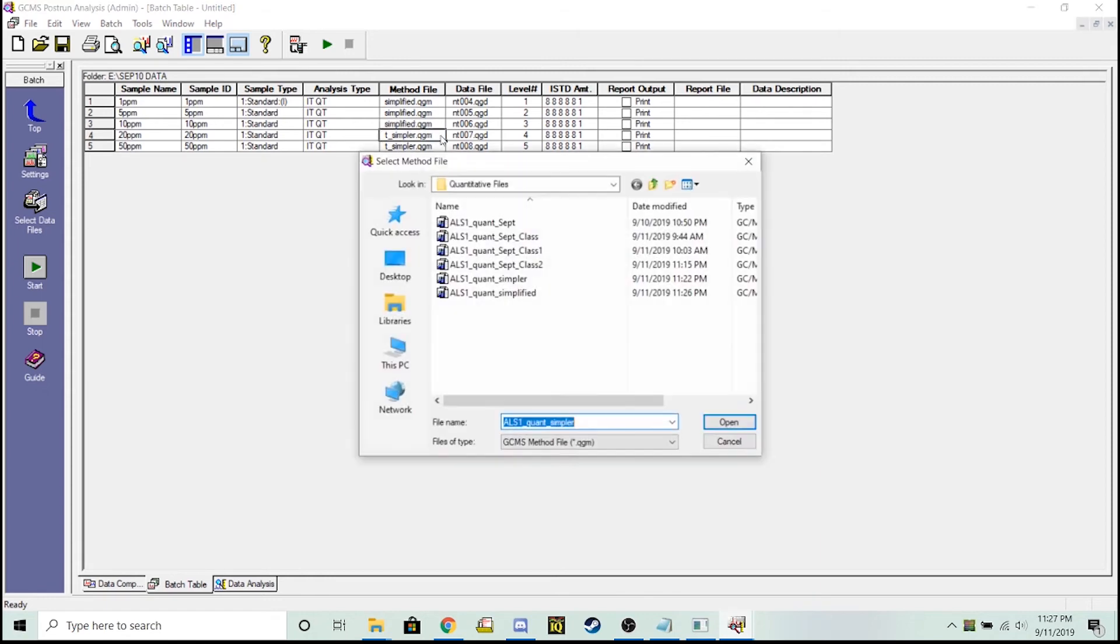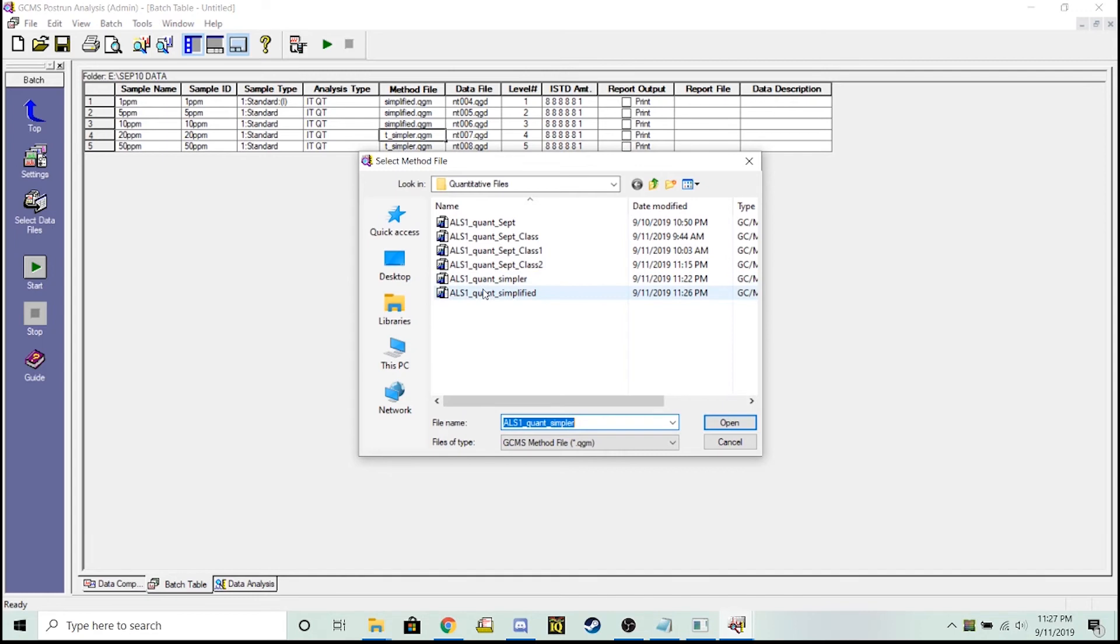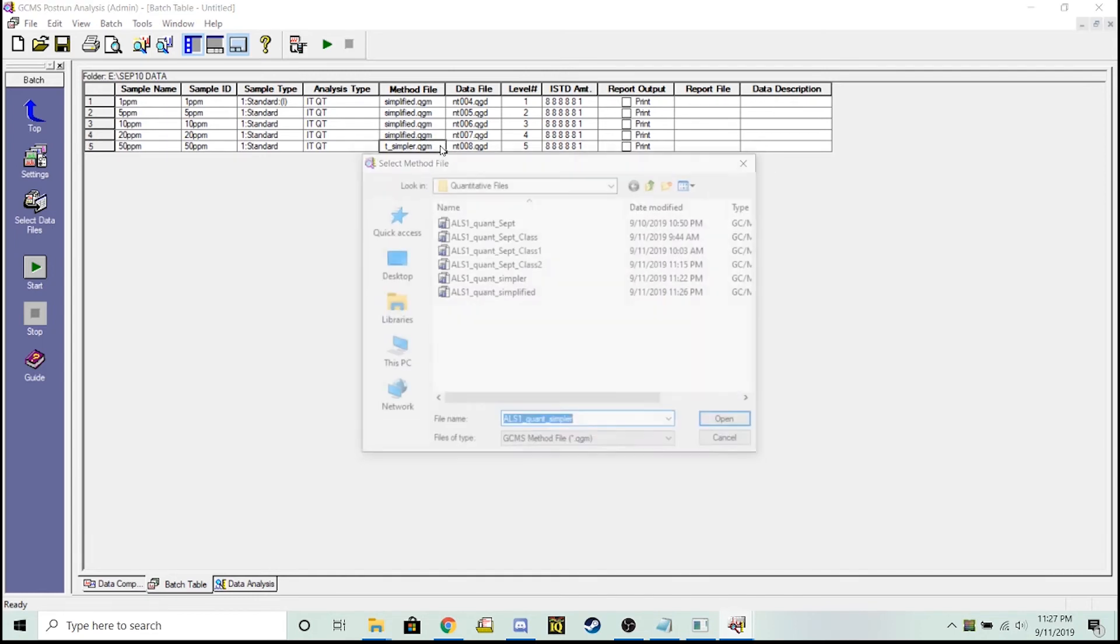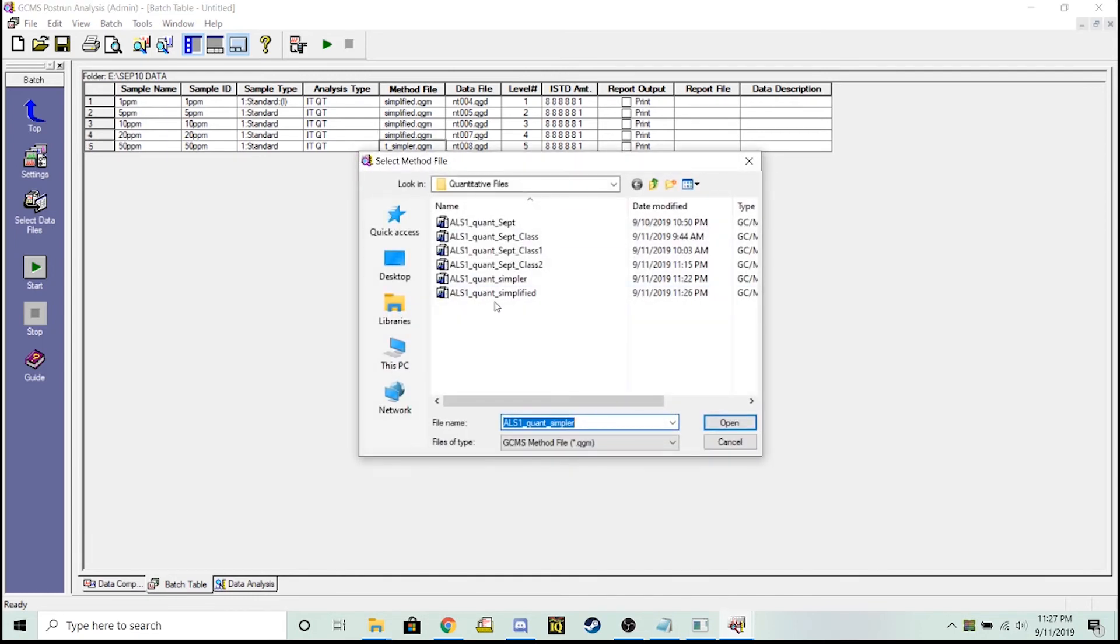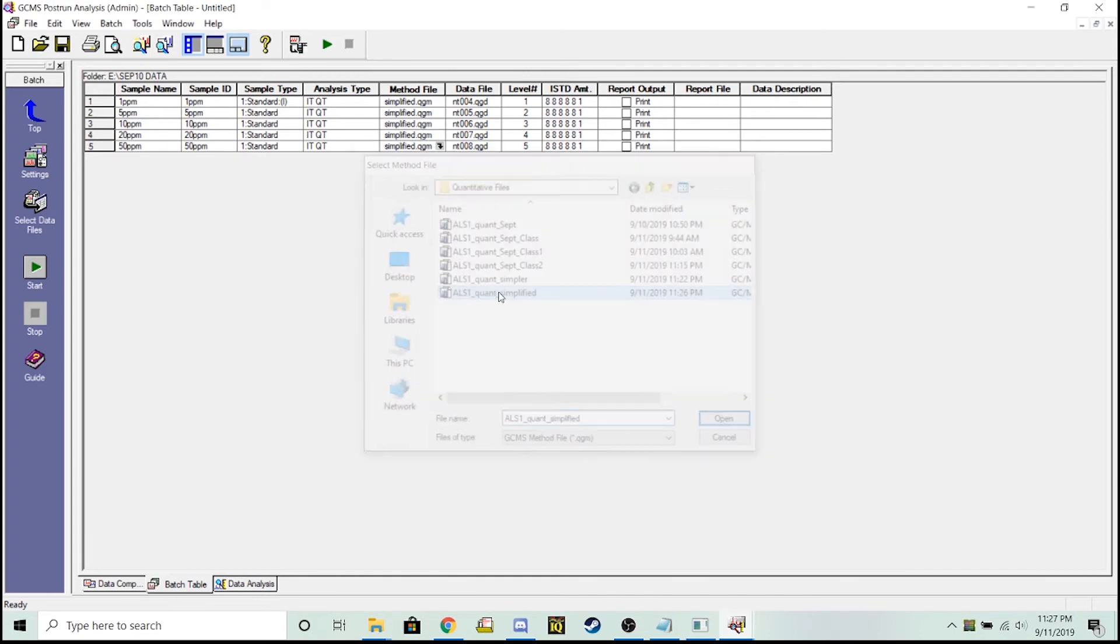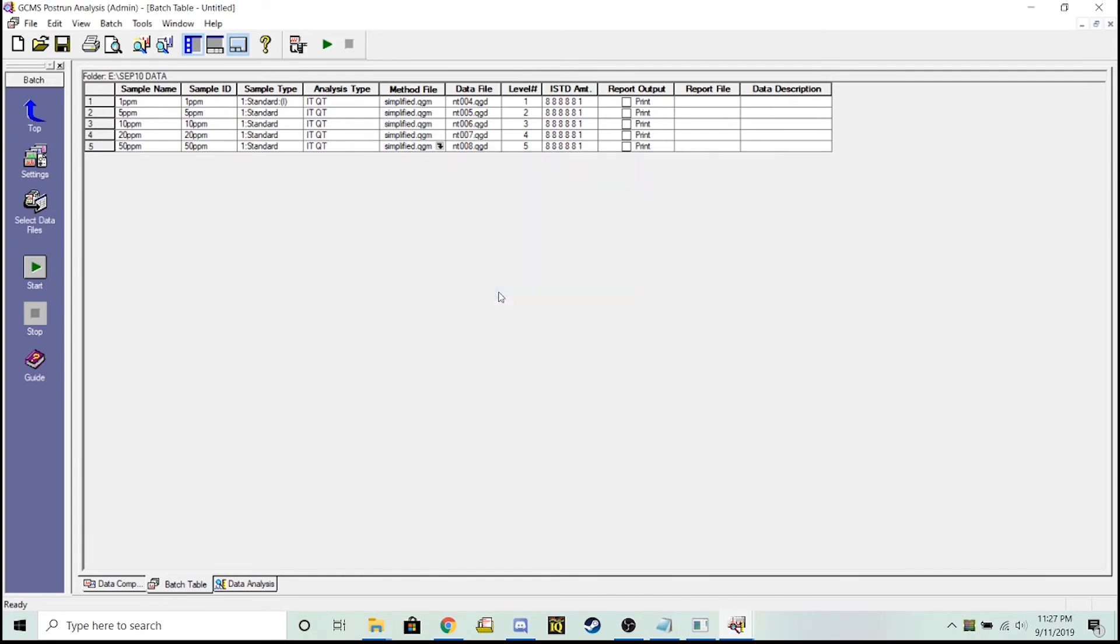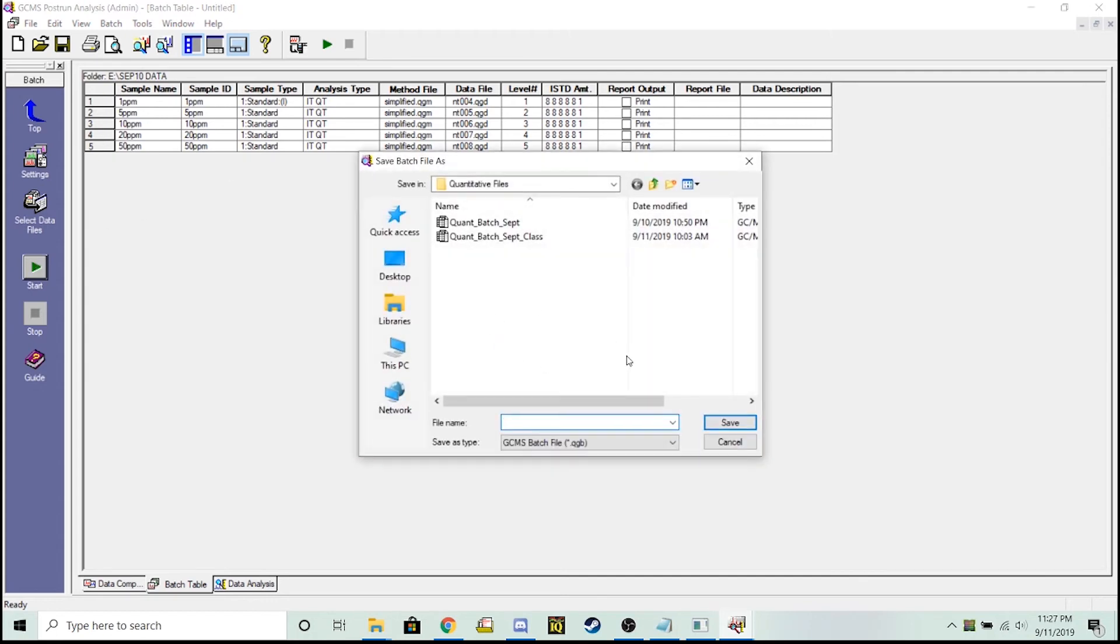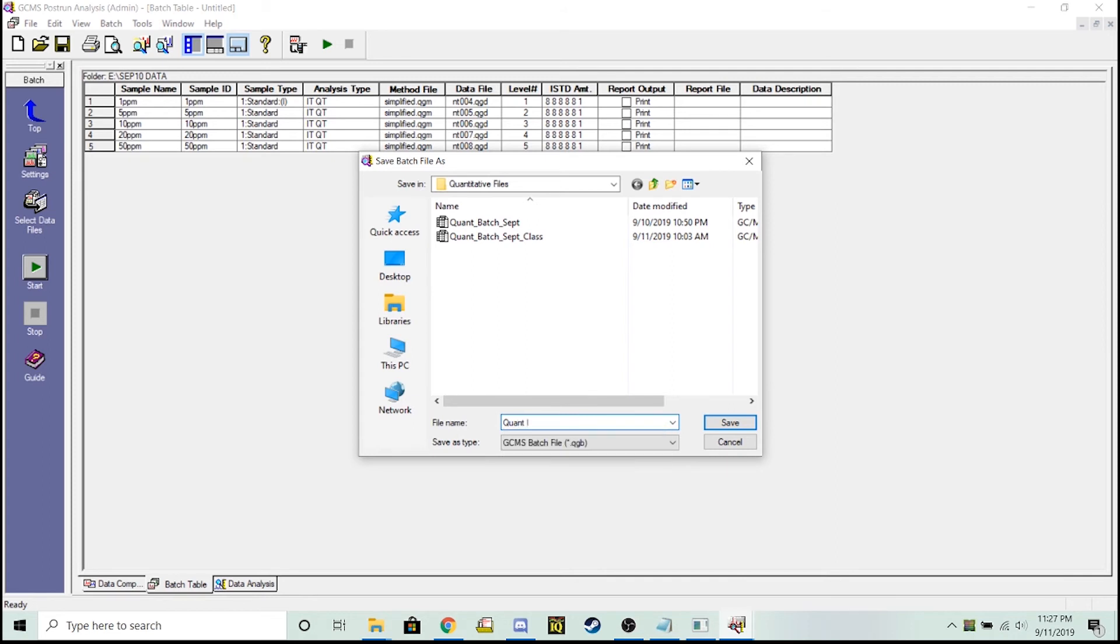Once all of these are selected, it's going to be as simple as hitting that start button and using this new method with the calibration curve for anything that I want to quantify for this 1,2,3,5 trichloro. So runs in the future, hit start. It'll think about each one. I'll save the batch on batch simplified.